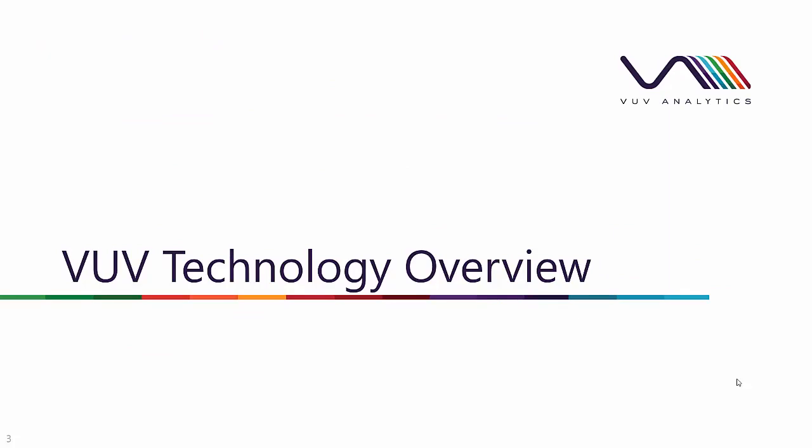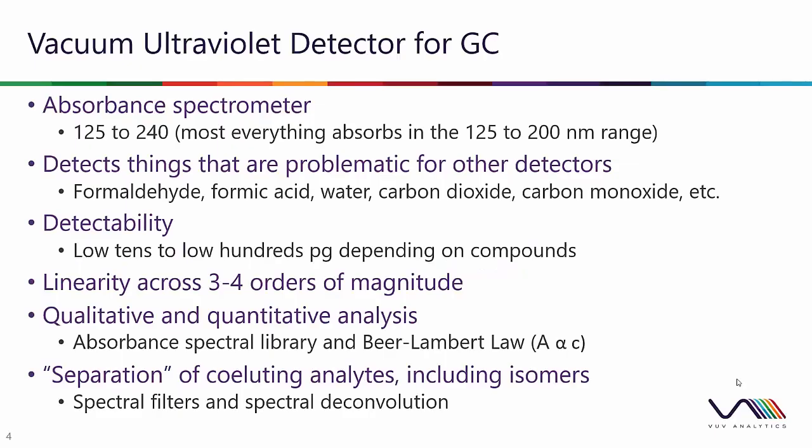So let's jump into the technology overview. The vacuum ultraviolet detector, or VUV detector for GC, is an absorbance spectrometer. So it collects absorbance spectra from 125 to 240 nanometers. And what's unique about this absorption region is that mostly everything tends to absorb this type of light. Consequently, it can detect things that are problematic for other detectors like formaldehyde, formic acid, water, carbon dioxide, carbon monoxide, and the detectability on column is from low tens to low hundreds of picograms depending on the compound's absorbance.